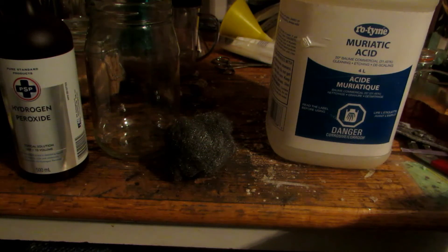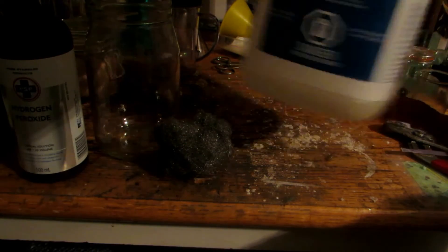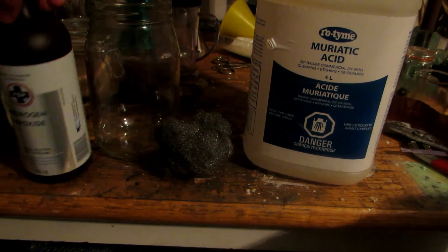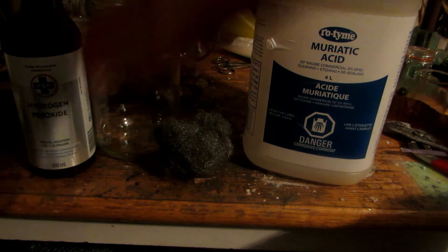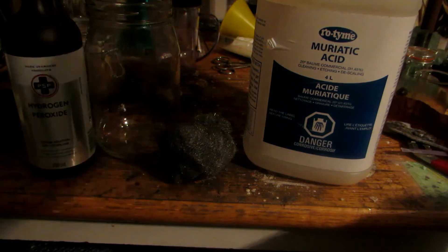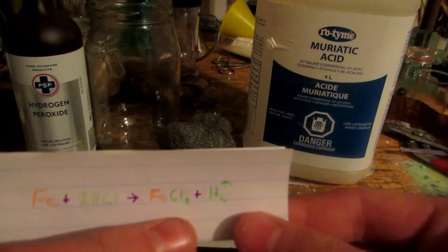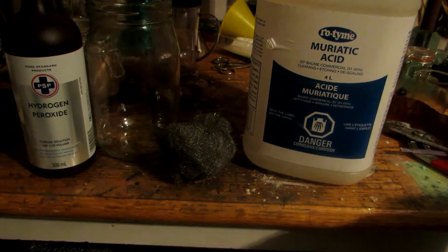Iron 3 Chloride can be produced using three chemicals: iron in the form of very fine steel wool to make the reaction go fast; hydrochloric acid, sold as muriatic acid at places like Canadian Tire; and 3% hydrogen peroxide. 35% could be used, but it's much more expensive and we don't want to waste it if 3% works. The first step is reacting iron with HCl: Iron + 2HCl → Iron 2 Chloride + hydrogen gas. So we'll go outside and start the reaction.